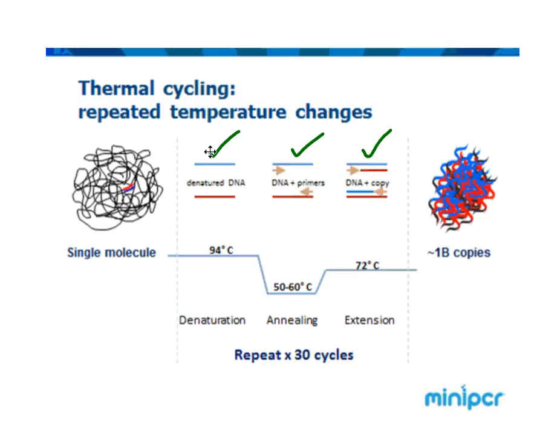So just so we know, denaturation is going to happen at 94 degrees Celsius, which is hot, really hot. Annealing, which is the attachment of the primers, so the temperature cools down, and then the temperature rises up a little bit to 72 degrees Celsius, and that will allow DNA copying to be made. Now, if you're wondering, those are really high temperatures, because 37 degrees Celsius is body temperature, right? 98.6 degrees Fahrenheit. So 72 degrees Celsius is way up there. I want to say it's somewhere around 160 degrees Fahrenheit, okay?